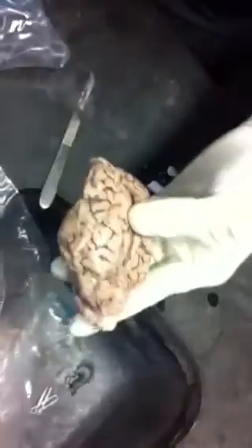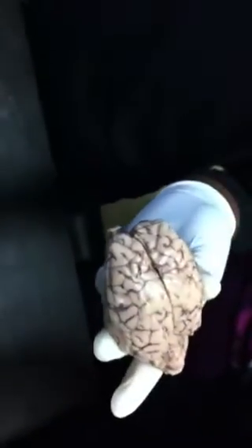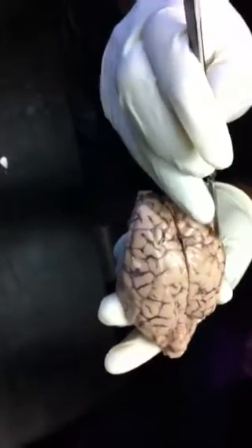What's a gyrus? Did we label gyruses? Now a gyrus just means a swelling, like an outward contour, while a groove is a sulcus. This thing here is a gyrus, an outward fold.